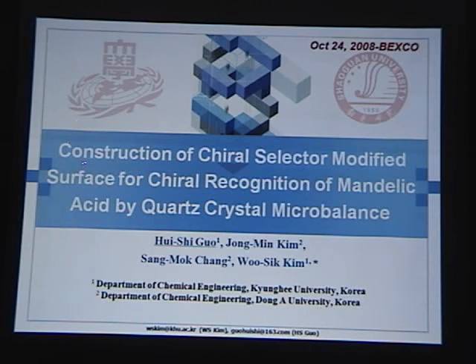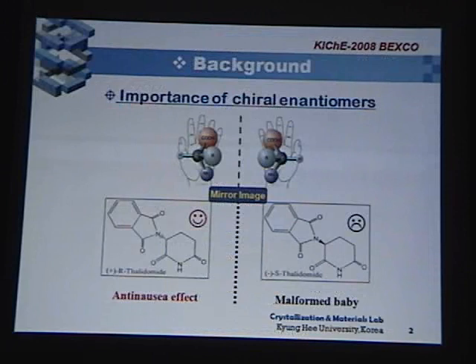The title of my presentation today is Construction of Chiral Selector modified surface for chiral recognition of mandelic acid by quartz crystal microbalance. At the beginning, I would like to mention about the background of this research.